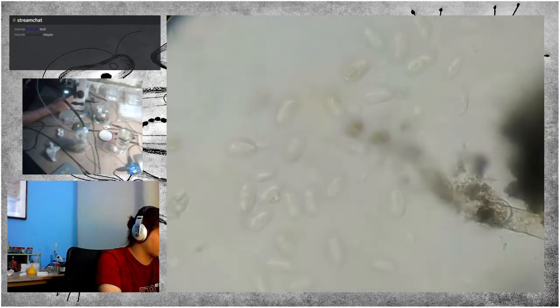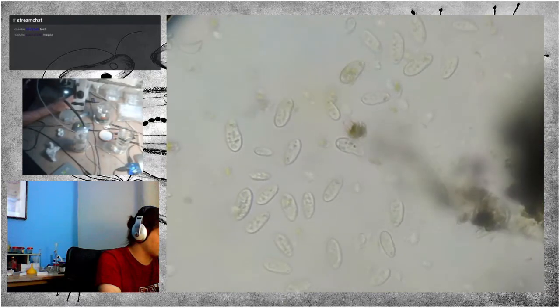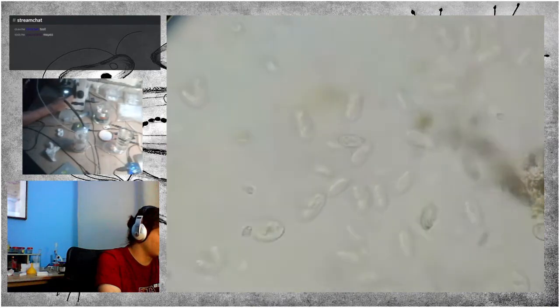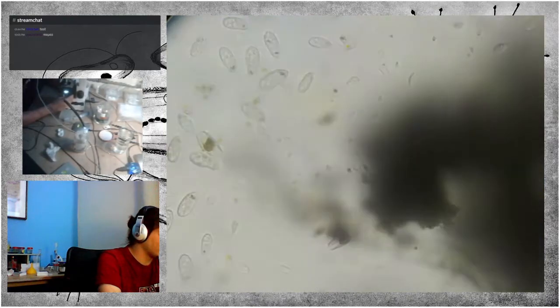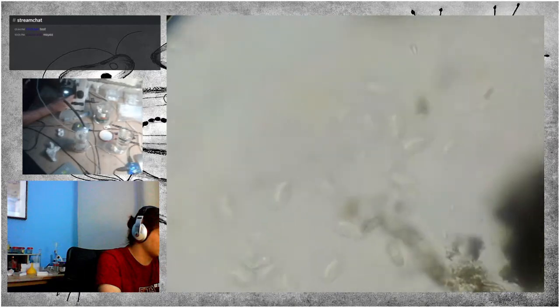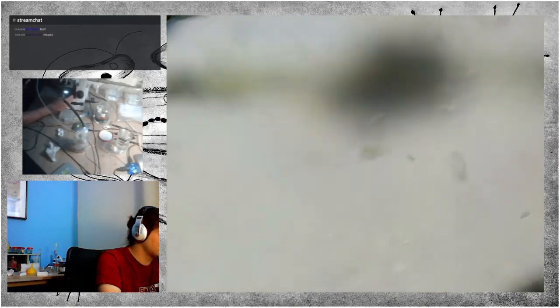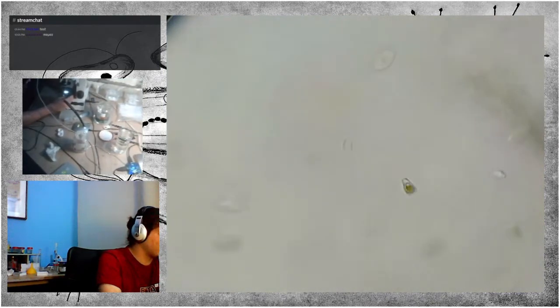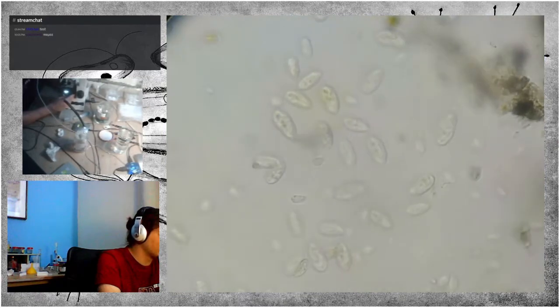Now, that diatom is not moving on its own. Oh, I lost it. Here it is again. It has unlatched from either the slide or the cover slip, and now it's getting dragged by the currents made by the cilia on the ciliates, obviously.